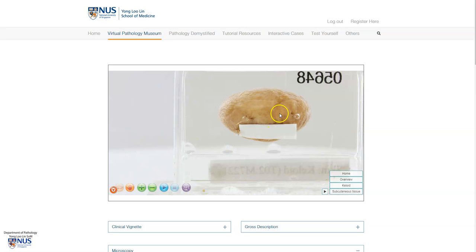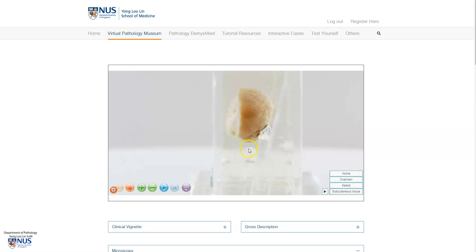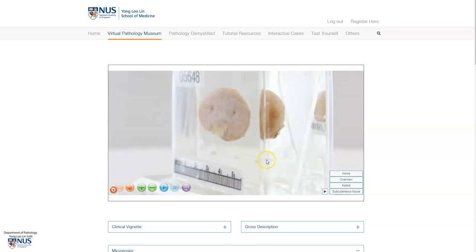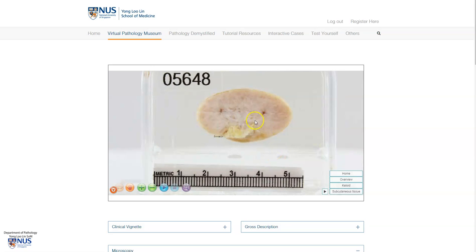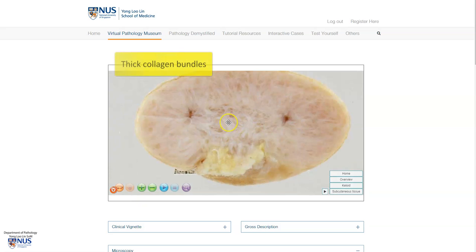The skin overlying a keloid is non-hair-bearing skin. We can see that the skin is intact with no ulceration. And on the cut surface, there is this almost swirly, whitish appearance. This is because a keloid is composed of very thick bundles of collagen, which imparts the whitish appearance grossly.